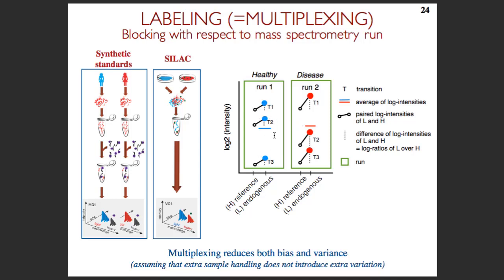And if we have a lot of variation, then we may not be able to say that this difference is systematically larger than the variation expected by random chance. However, we actually have this labeled reference peptides spiked in each run, and these black dots correspond to these reference peptides that we have. And remember, these black dots have no biological variation, only technological variation.